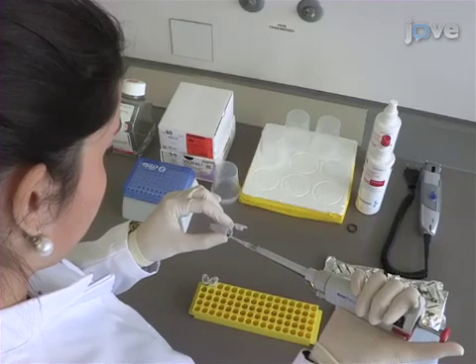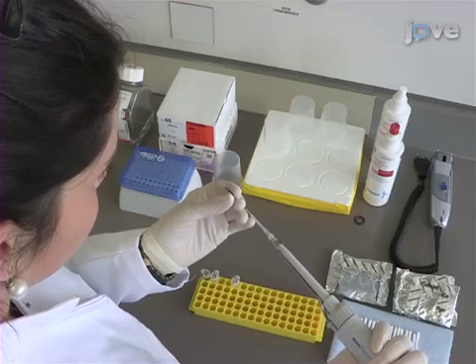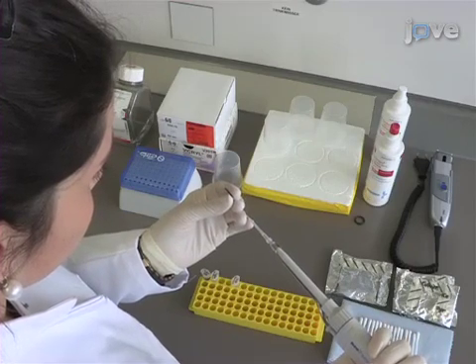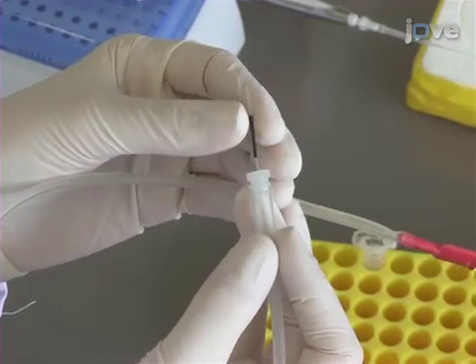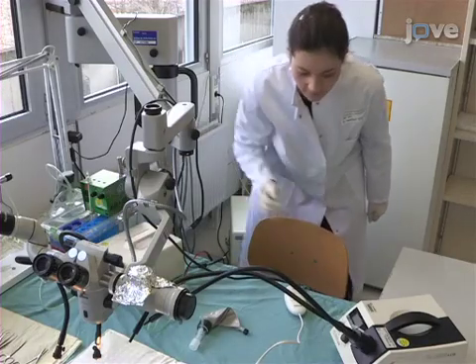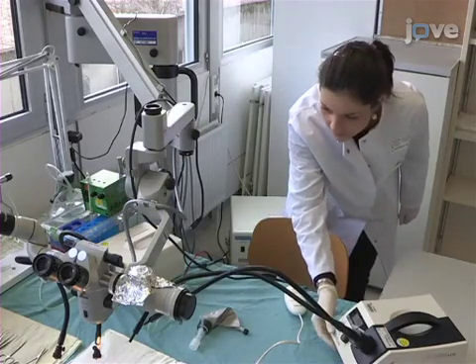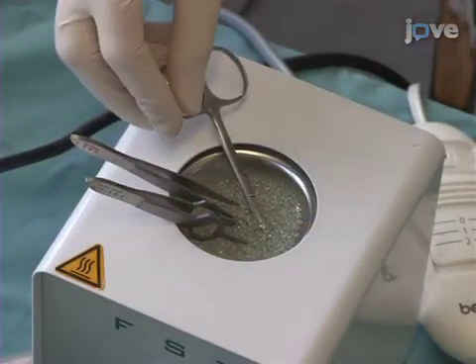Load 10 microliters of the DNA solution into the glass micropipette, then connect the glass micropipette to the injection system or a mouth pipette. Prepare the surgical table with a heating pad and the surgical instruments. Turn on the cold light sources to facilitate the visualization of the embryos, then disinfect the surgical tools using a glass bead sterilizer.